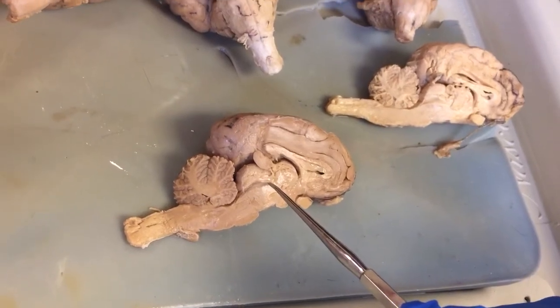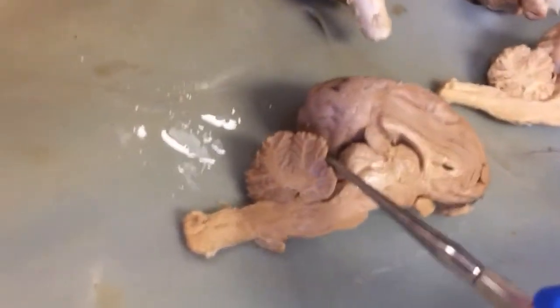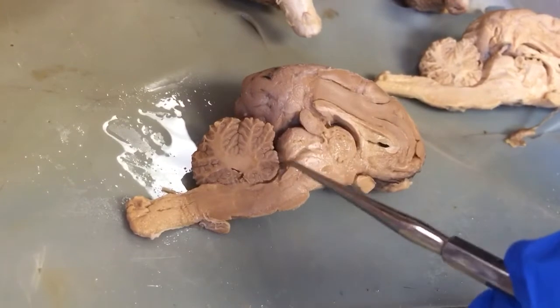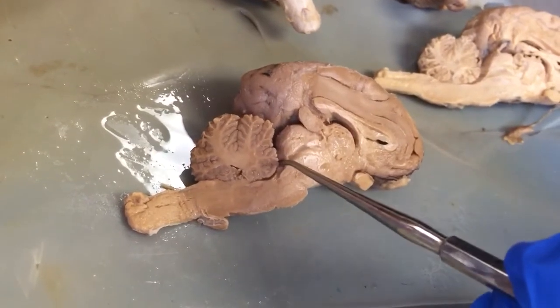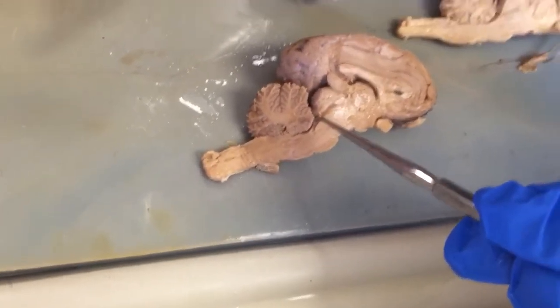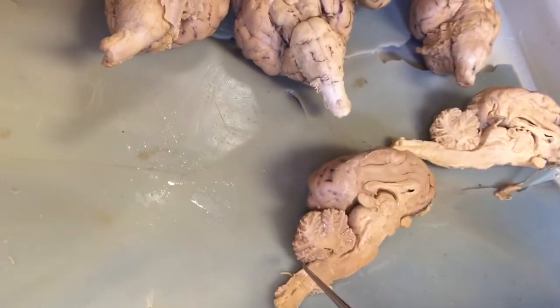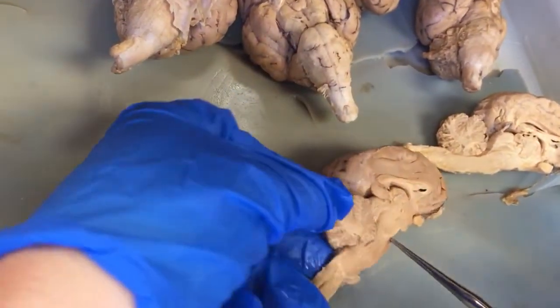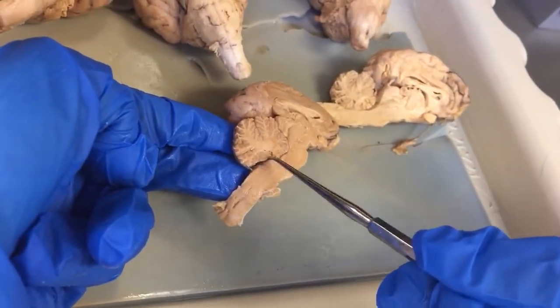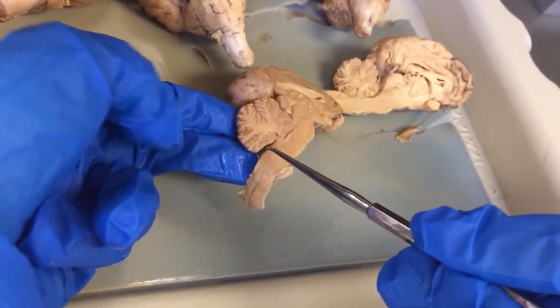Fourth ventricle is just between the posterior colliculus and the cerebellum here. So our fourth ventricle is just this little space here. Sorry, I got cross-eyed. The fourth ventricle is back here, above the spinal cord and medulla oblongata and below the cerebellum. So this is the fourth ventricle.